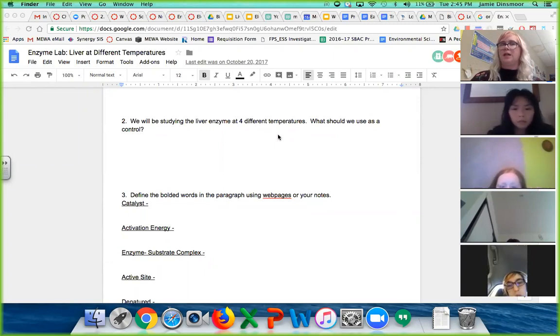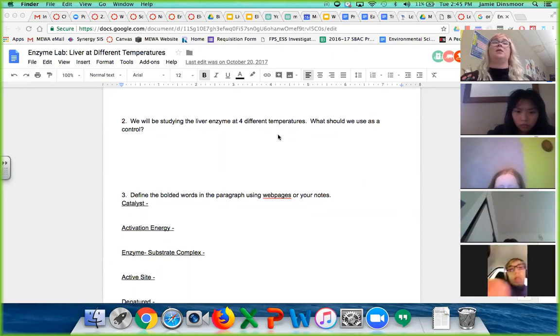Elizabeth, I think, is saying, oh, yes, Colin, I almost missed your answer. A chicken liver without anything added to it will be our control. Yeah, that is one way we could do it. We're also going to just pour hydrogen peroxide into a cup and see what it does by itself, right? Because if we're measuring the amount of bubbles produced here, we want to make sure that the hydrogen peroxide is not just bubbling like crazy on its own, because then maybe the liver's not doing anything.